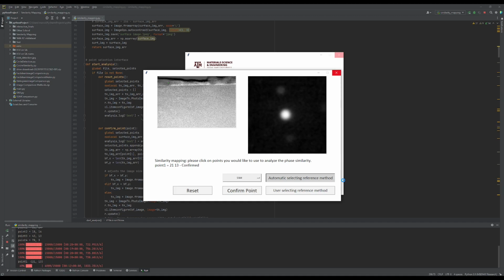These images can be analyzed to determine the ideal cutoff threshold that clearly identifies all the variants present in the dataset. For more information on the methods used in this program, please refer to the manuscript or feel free to reach out to the authors with any questions.